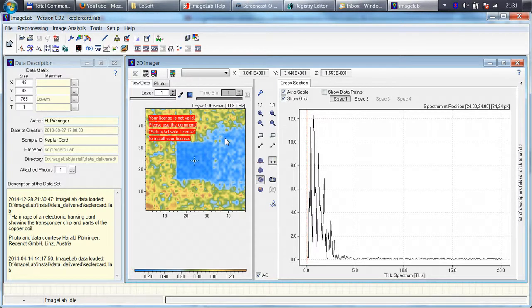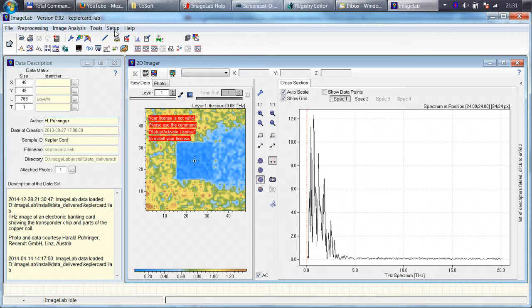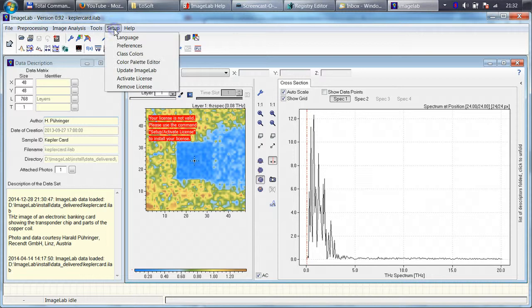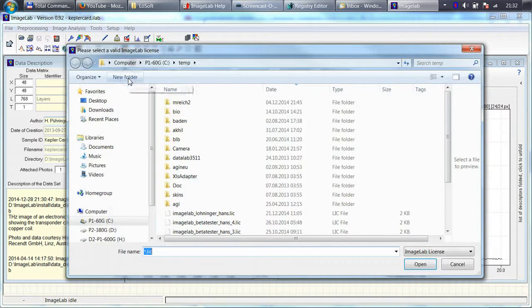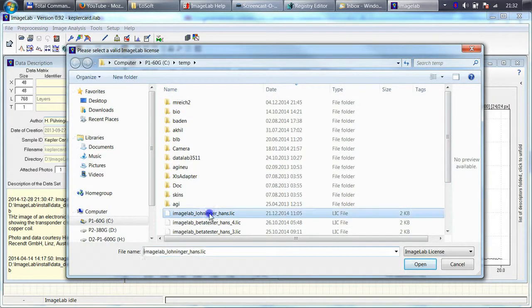In order to load this, just click on Setup, Activate License, then select the license.